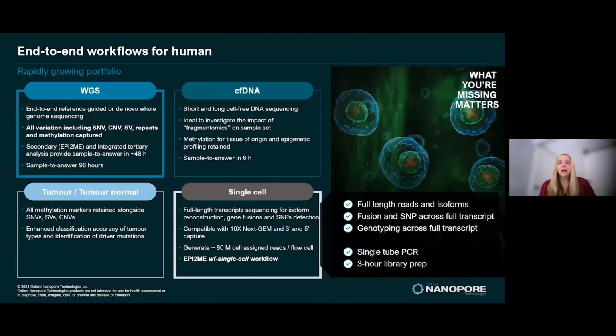For discovery work, identifying novel antibodies or profiling your CHO cell lines or animal models to evaluate where your target genes of interest may have inserted in the genome, you could consider nanopore whole genome sequencing with methylation to ensure that there are no hyper or hypomethylation, for example, in promoter regions that could affect therapeutic protein expression, as was done by Dr.